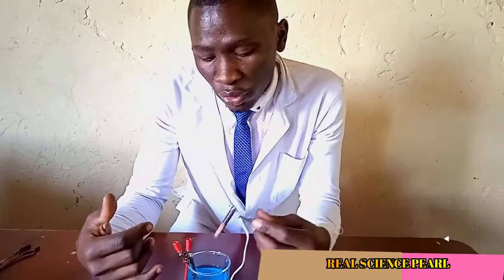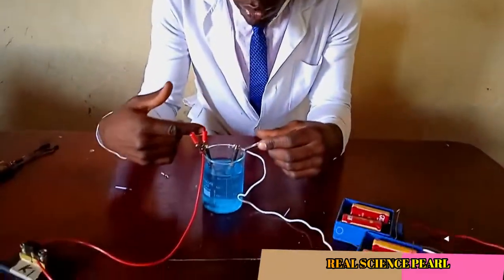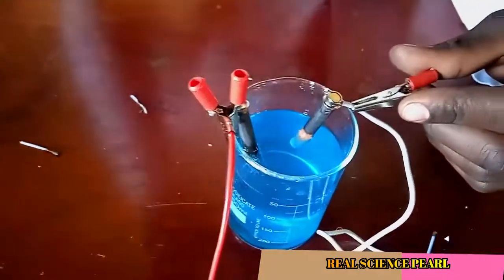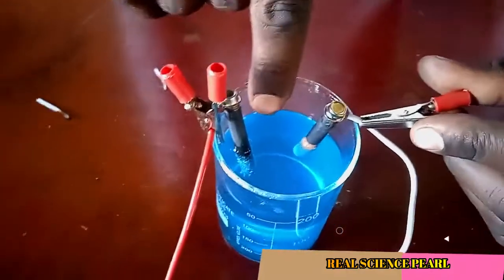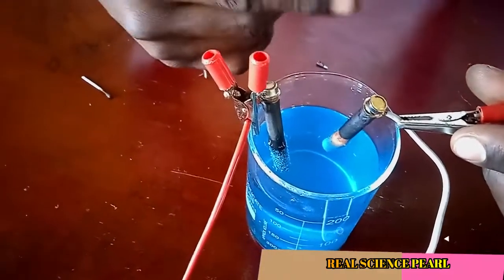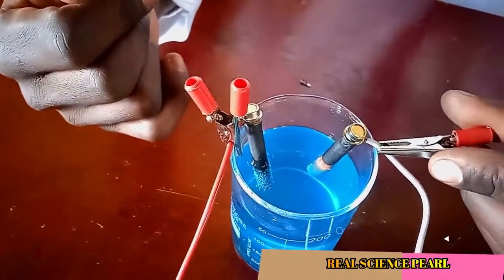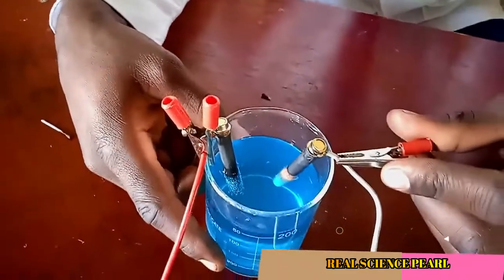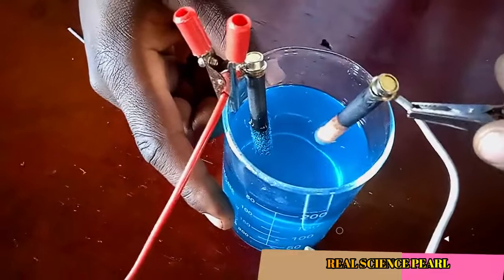And if I remove this electrode, these are graphite electrodes, we shall not have further production of oxygen even at the anode, because the circuit is going to be incomplete. So if I return it, I'll be having some more bubbles of oxygen being produced, though they are not very many. We know that graphite conducts electricity because of the free mobile electrons. And copper sulphate solution conducts electricity because of the free moving ions, not electrons.